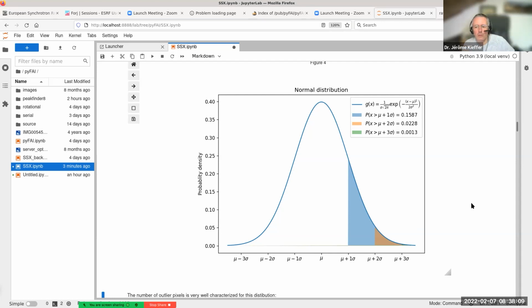So one of the core ideas is, what has information, let's say above 2 or 3 sigma, is only outlier data and probably Bragg peaks, maybe something interesting to look at. And what is below, let's say it's just some background noise, and just model it with the mean value and the standard deviation.